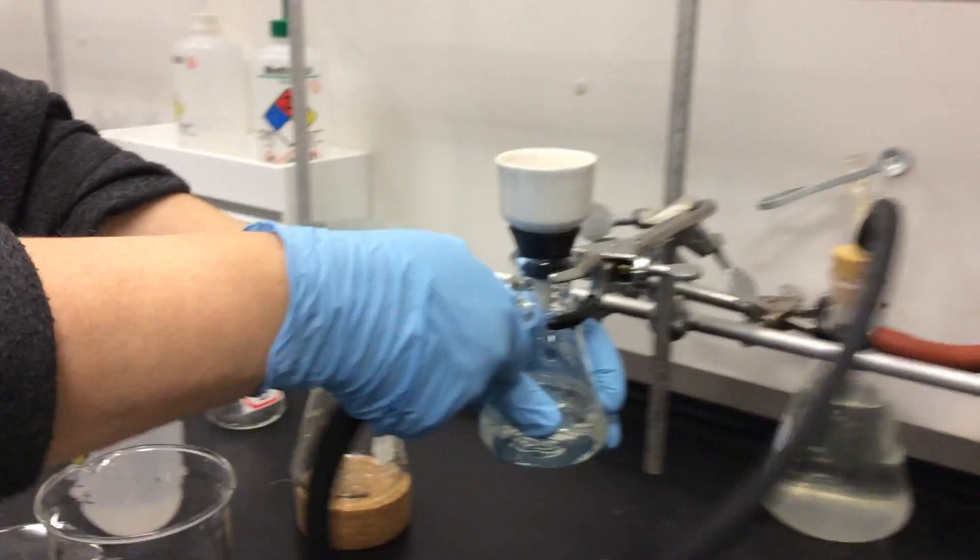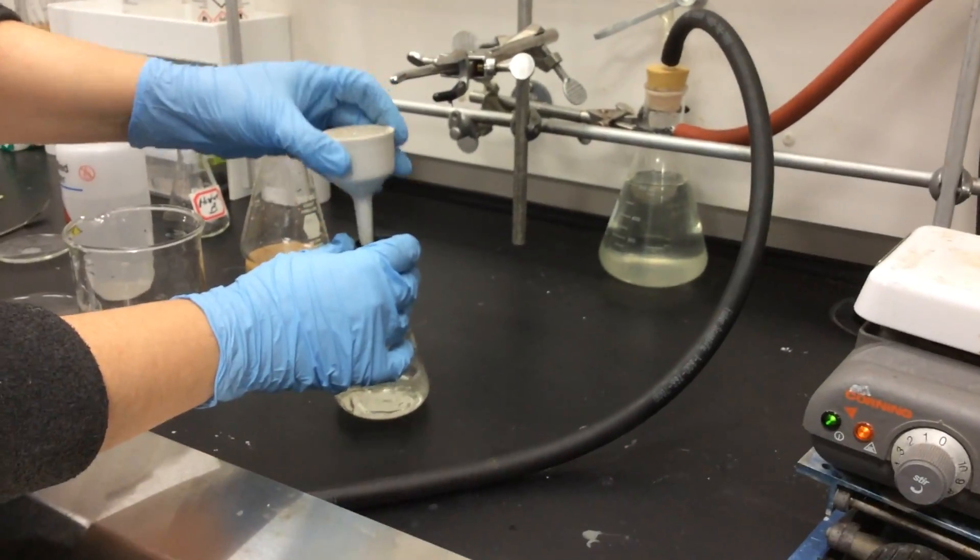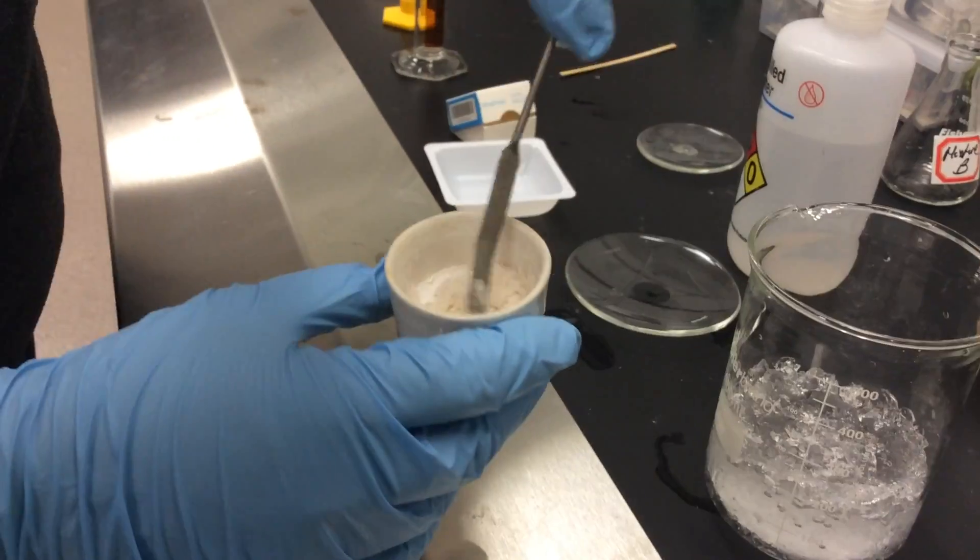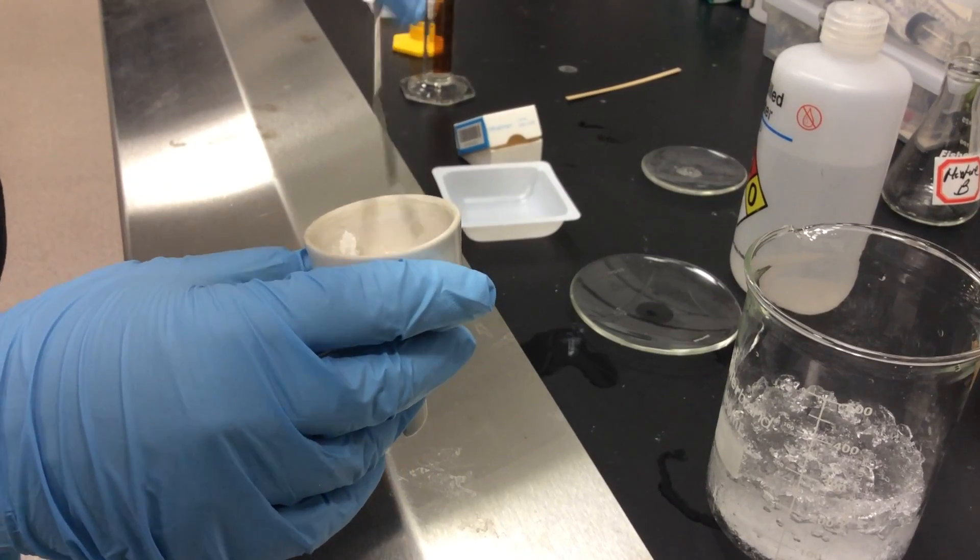Now we need to disassemble the vacuum filter, pull the aspirator, shut off the water, take the flask down, take the Buchner funnel out. Now we have pure crystals. As you can see, they're much nicer than the crude ones.